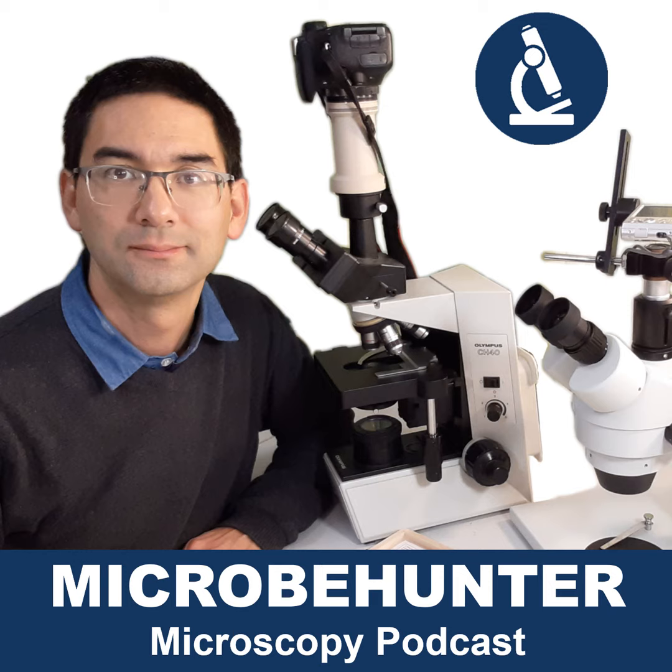You just want to have a very high contrast in order to make focusing much easier. And when everything is in focus and everything is centered, then you can switch to the next higher magnification. But I would not open the condenser. Also, maybe because if the light is too bright at the beginning, then it might hurt your eyes. Yeah? But finding the center of the specimen and the correct focus at first, close the condenser, makes life much easier.